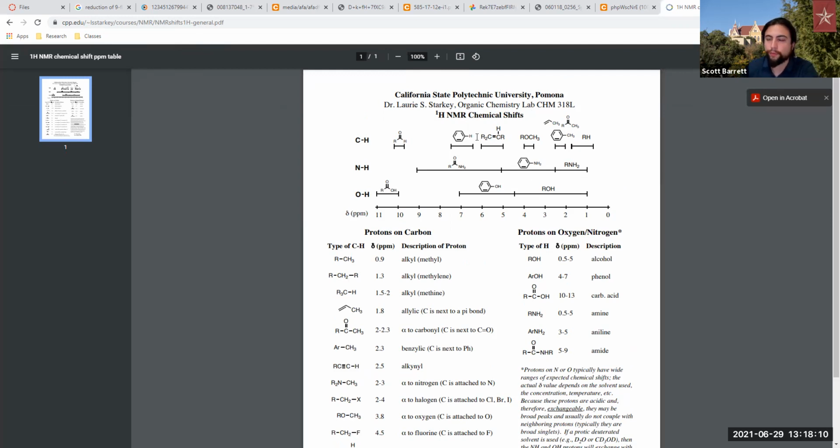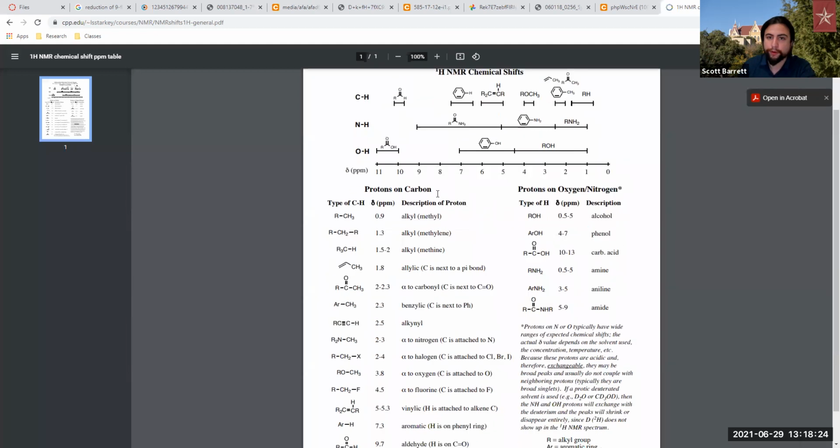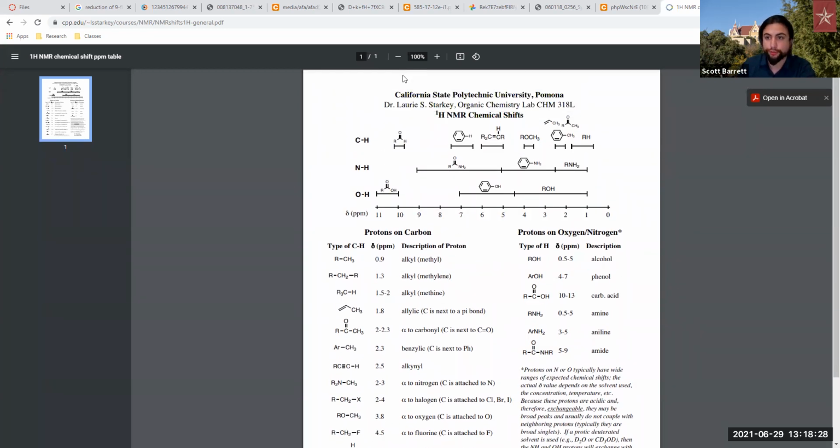And it is important for you to remember where these locations would be, because I would expect on the final for them to provide you with some chemical shifts and then ask you to say, which functional groups are these? And so it would be important for you to try and remember the relative range, and especially the most important ones that would be extremely out of place, such as the carboxylic acid and aldehydes, or even all the way up to just the alkane groups at the start.